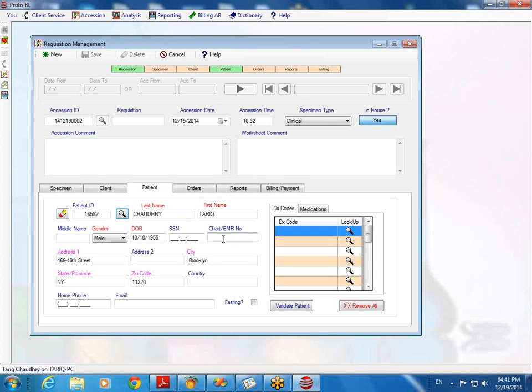To be more specific, we have situations in which we need to return leftover tissue to an institution. Would this system be able to accommodate that in the sense of date shipped out kind of information? Well, I'm sorry, I need a little more elaboration on that. I did not quite get what you asked.